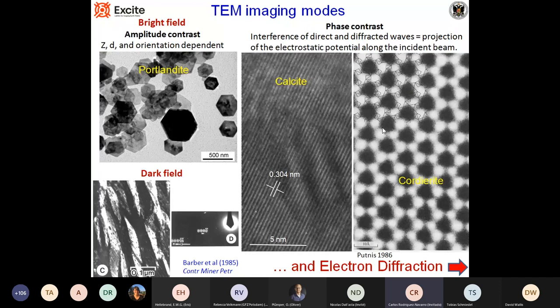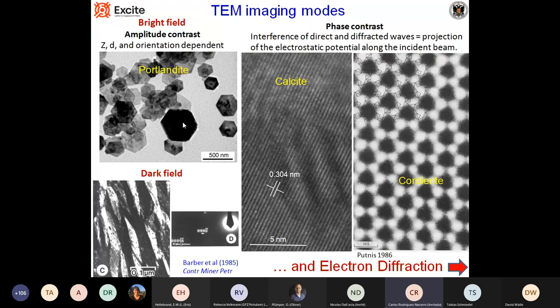If we go into the basic imaging modes that we can get with the TEM, we have basically two modes: bright field and dark field. In bright field, we can have images of the sample by different types of contrasts. We can have amplitude contrast, where the contrast depends on the atomic number, the thickness of the specimen, and the orientation of the sample. Here you see an example — the shape of this nanocrystal, in this case calcium hydroxide.